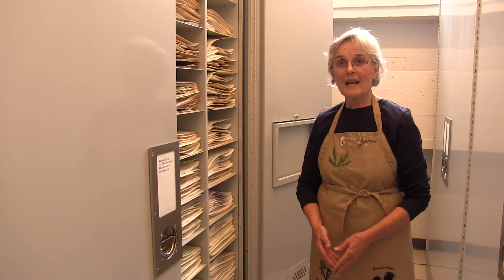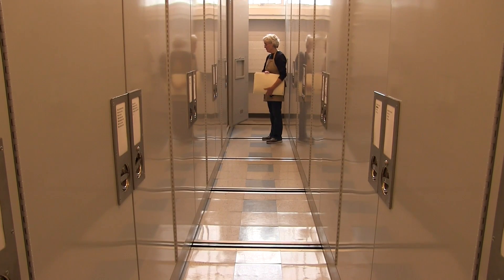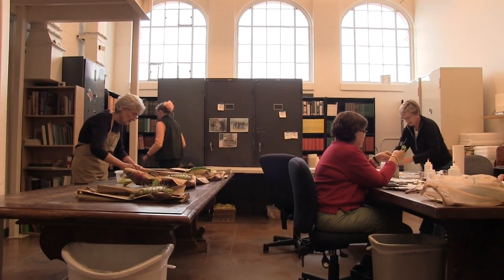I'm Jeannie Gregory and I work here in the herbarium. I've been working on cacti probably about 10 years now.